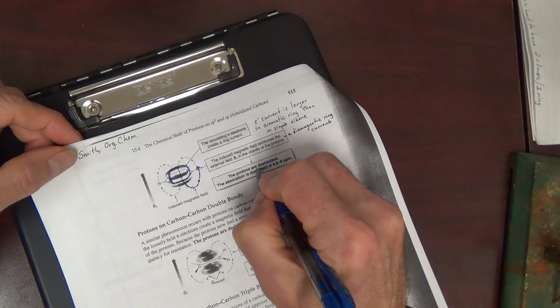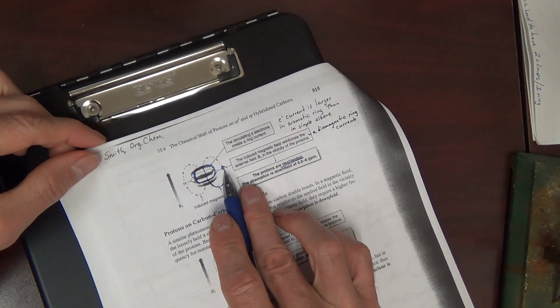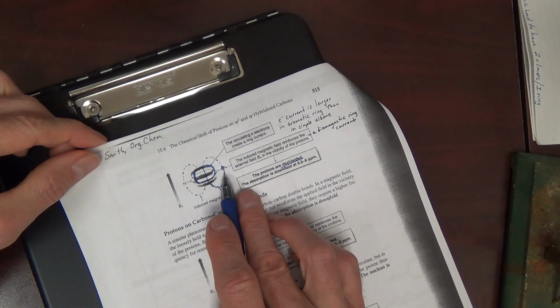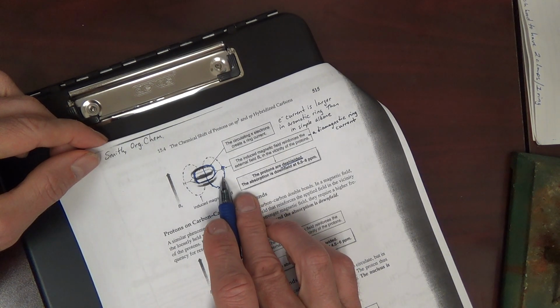Okay? Because it's not acting like sunscreen. It's not diminishing the sun or the magnet. It's actually adding to it out here. That's like not putting on sunscreen, but putting on something that's going to cause you to become sunburned even quicker. And so that's the opposite of shielding.